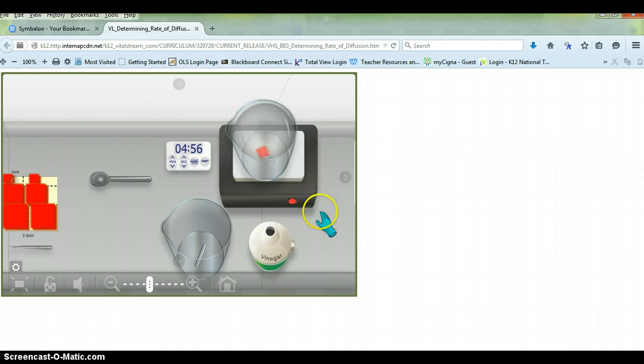Alright, and what we're waiting to see is the vinegar, which is a weak acid, will end up moving into the agar block. And the agar block has an indicator, which you know what an indicator is now. A red indicator called phenolphthalein, which is one of my favorite words, because it looks funny when you try and pronounce it. Anyhow, the phenolphthalein is an indicator for acids. So as this cube is being bounced around, the vinegar is going to interact with the phenolphthalein molecules.